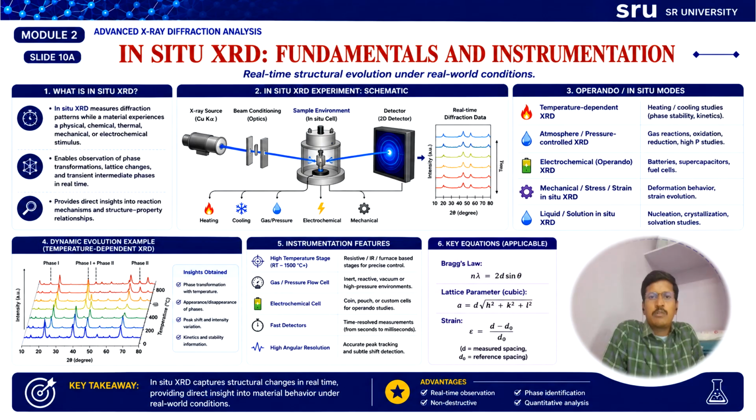Now let us discuss the advantages of this characterization. It provides the direct observation of structural changes during the operation. The second, it helps to correlate the structure property relationship in real time conditions.